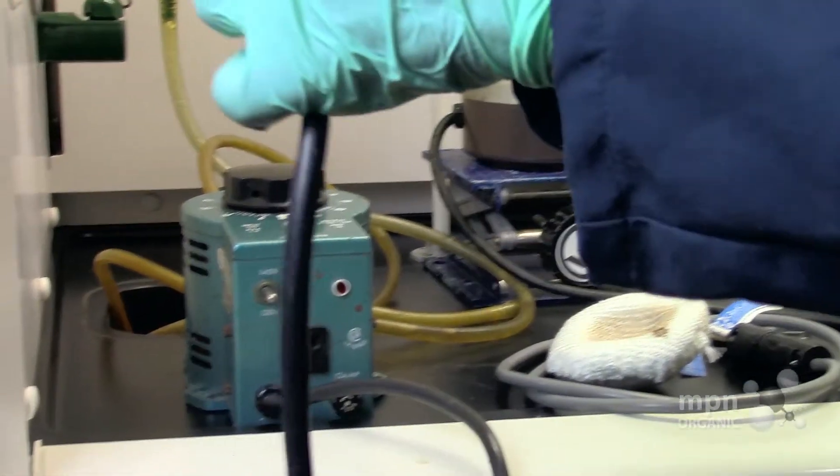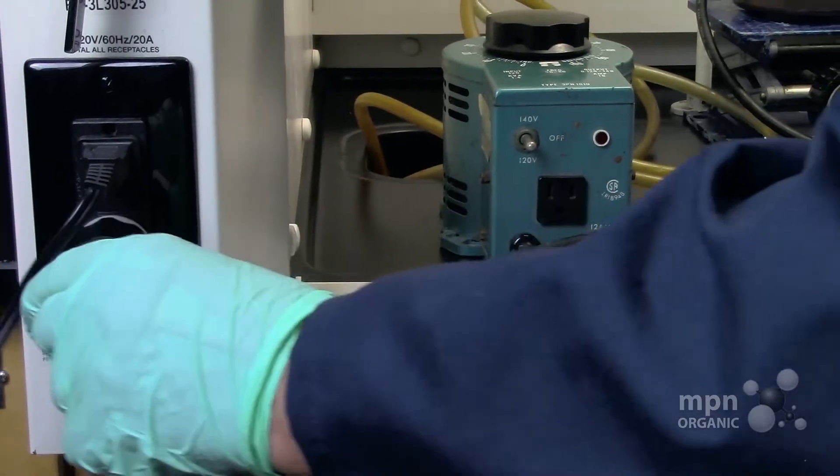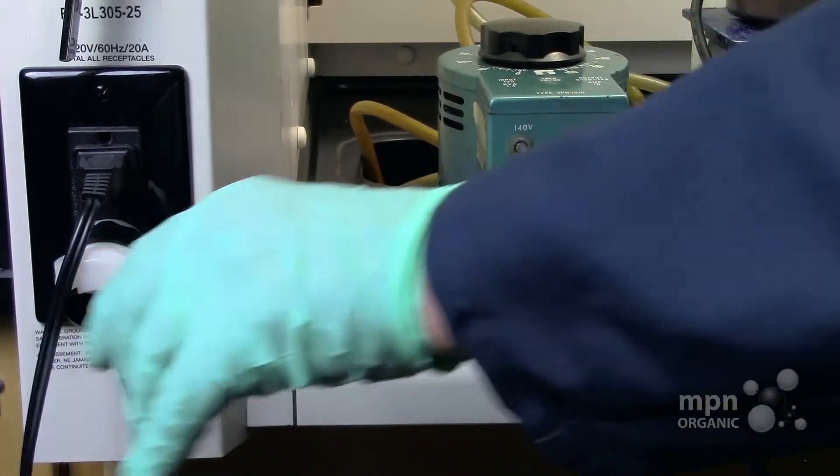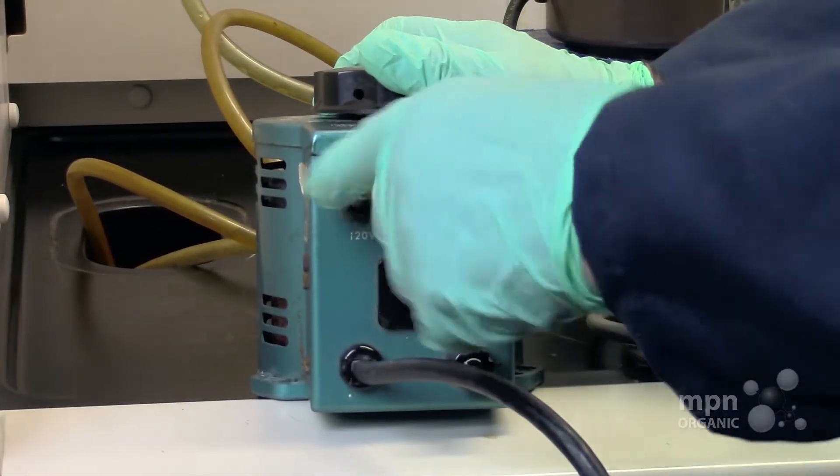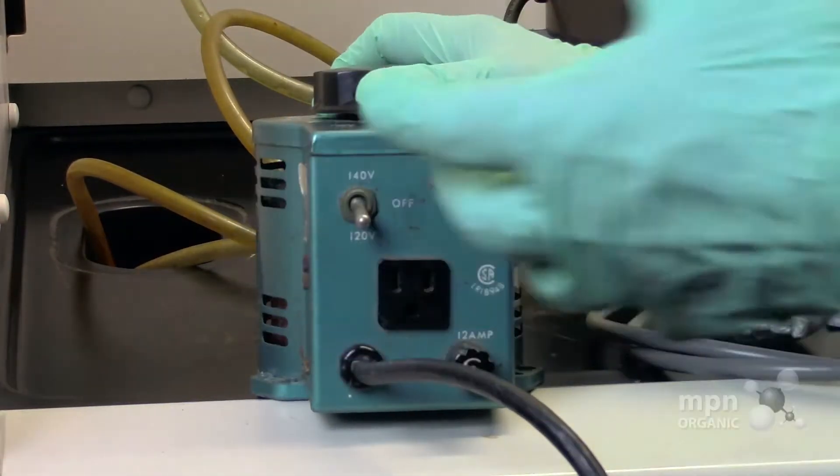First of all, we're going to plug our heating mantle into the 120-volt supply. Now there are two actual settings on this variac. Students ask me this all the time: should I set it at 140 or 120 volts?